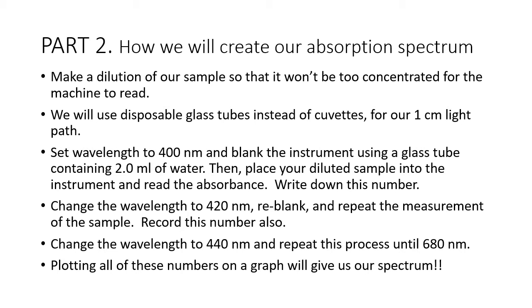Oh yeah, parts 2 and 3, we don't want to have too much waiting around for the spec. So you can do either part 2 or 3 first, right, and then switch to relieve the congestion at the spectrophotometers. They both use the dilutions that we just made, and the order does not matter. So pick one that sounds best to you.